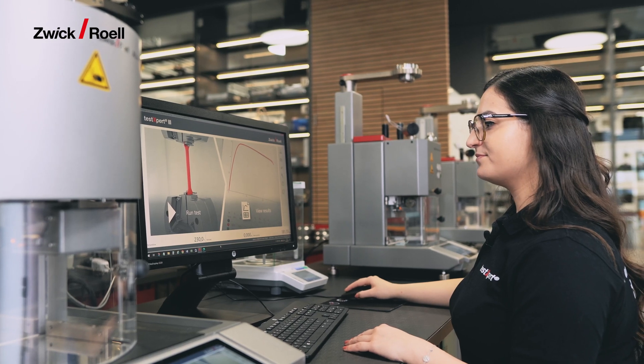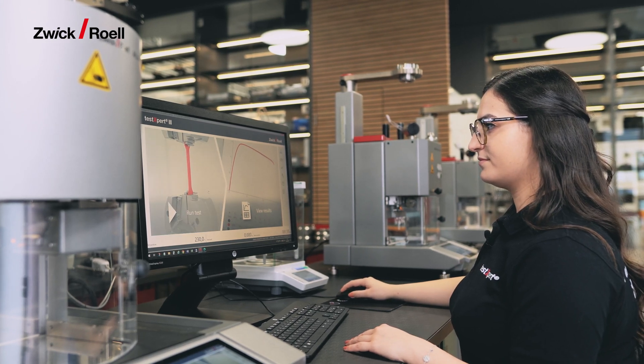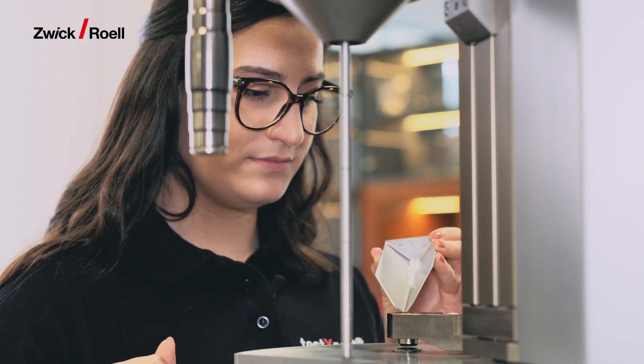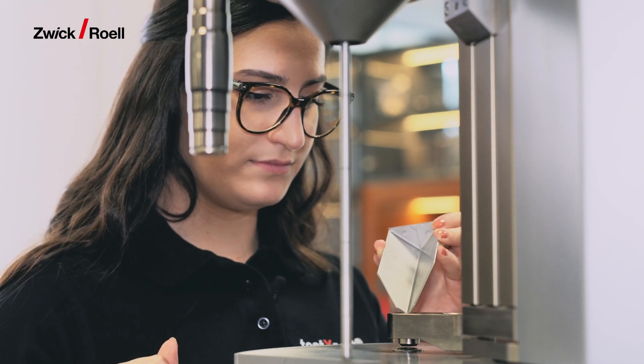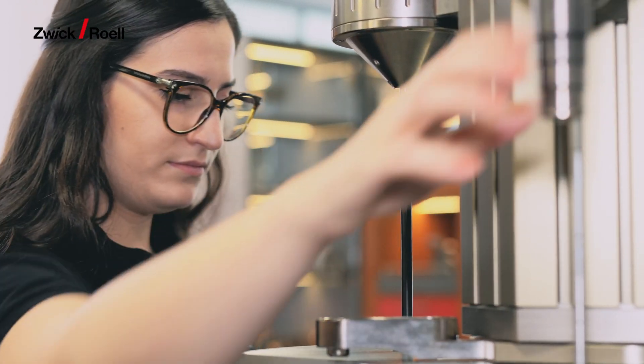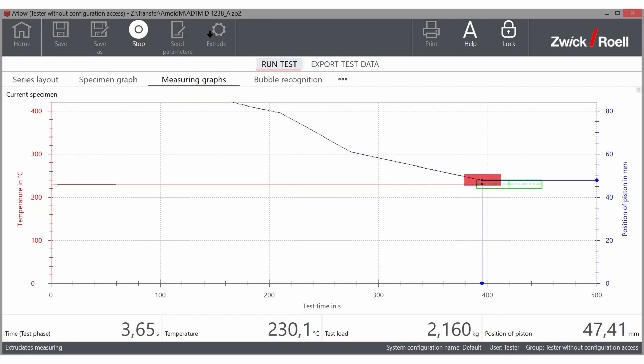First I open the pre-programmed standard test program. Then I enter the temperature and respective test slot. Now all I have to do is add 5 grams of polymer, then simply press start for a 100% standard compliant test with optimal parameters.